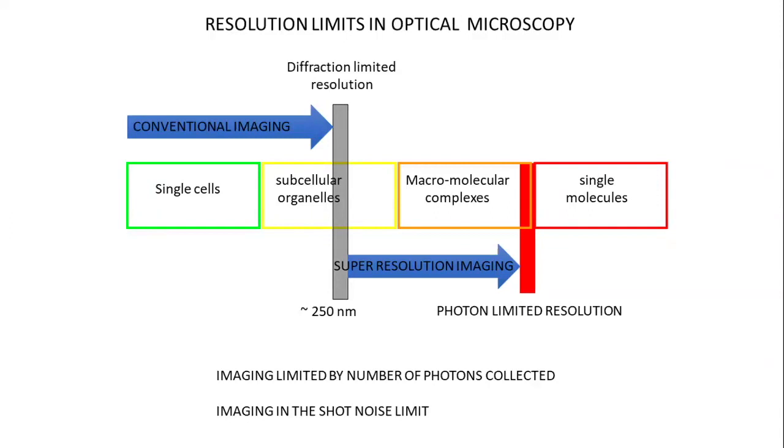In the lab here, we're down to 10 nanometers for single molecule localization. There are instruments around nowadays that will get you down to 3 nanometers to localize a single molecule, but that's a rather specialized device.